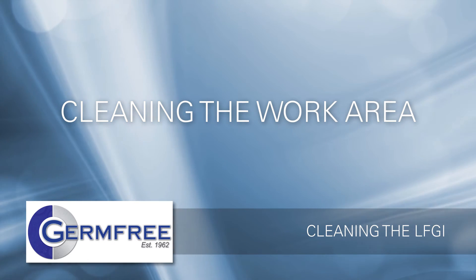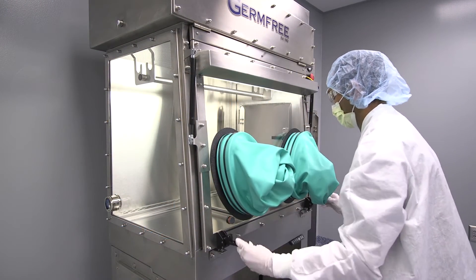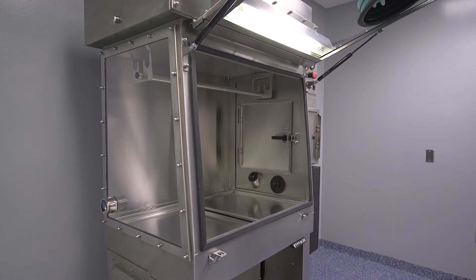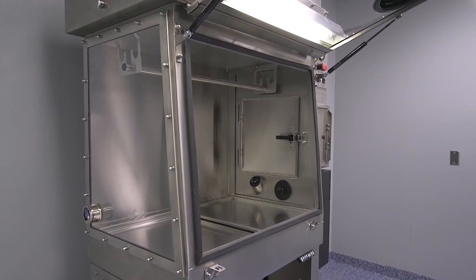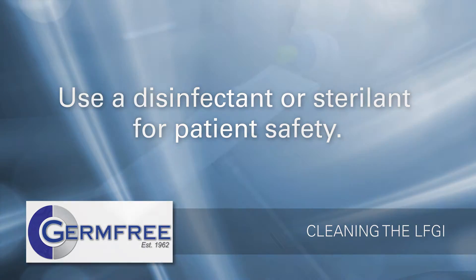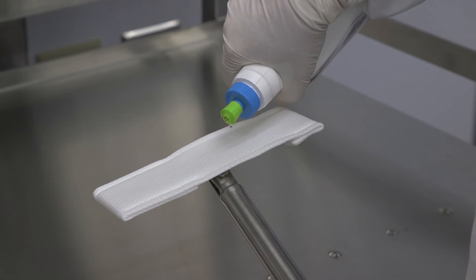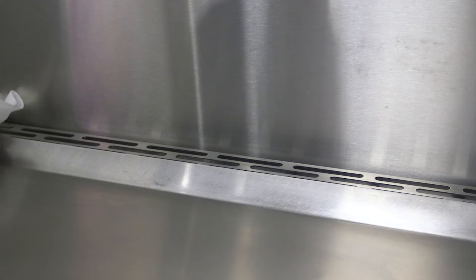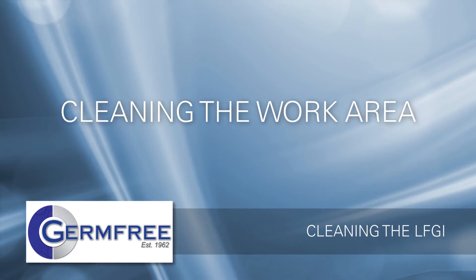Once you've finished cleaning the airlock, you're ready to begin cleaning the inside of the LFGI, also known as the work area. It may be necessary to open the front viewing window to properly clean your LFGI. The front window should only be opened after a proper light cleaning has been performed and only while wearing full personal protective equipment. To maximize patient safety, a disinfectant should be used on all work area surfaces. Use wipes or cleaning pads to avoid dripping dirty solution onto cleaned surfaces. If needed, remove any disinfectant residue by wiping all surfaces with sterile water or sterile 70% isopropyl alcohol.